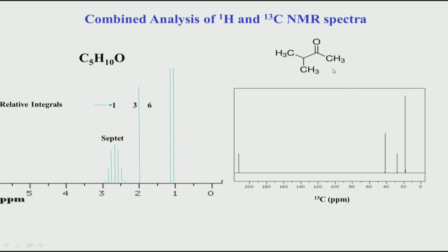This is the structure of the molecule which we saw earlier, and this explains the carbon spectrum, because the carbonyl is a ketone, which comes very downfield shifted, and because this CH3 is isolated, it will come from here. The CH attached to CO is slightly downfield shifted, which will come from here. But again, which carbon is which, we are not sure from here. That connection between the proton spectrum and which carbon is part of the 2D experiment. We will do that later.